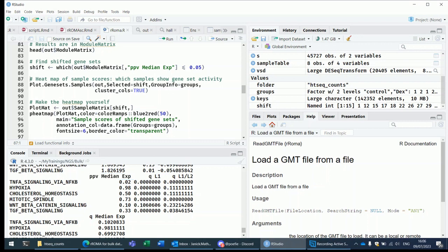The q-values are p-values that are obtained by using a false discovery rate-based multiple testing correction method. So typically, the Bonferroni is much more stringent than the false discovery rate-based method. So if you have a limited number of gene sets, you typically look at the p-values. If you have a high number of gene sets, you are going to look at the q-values. So 50 is not so big, so we are going to focus on the p-values.